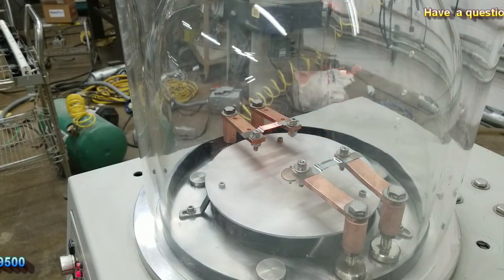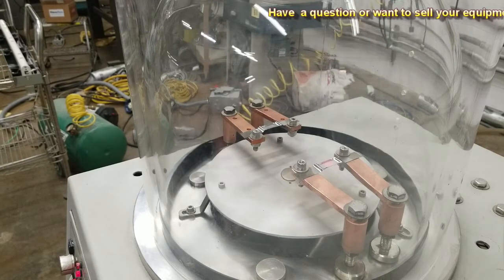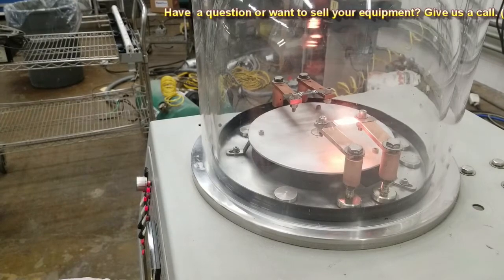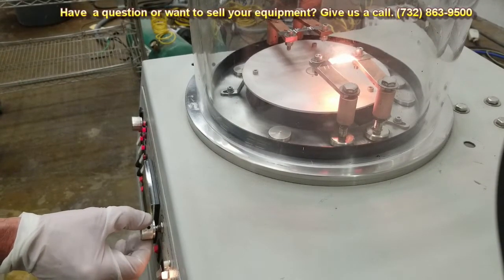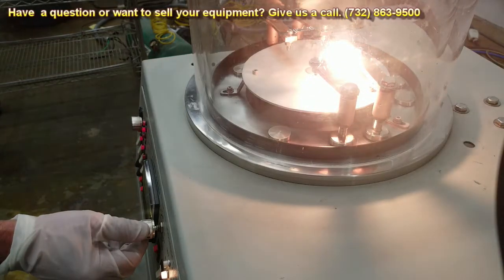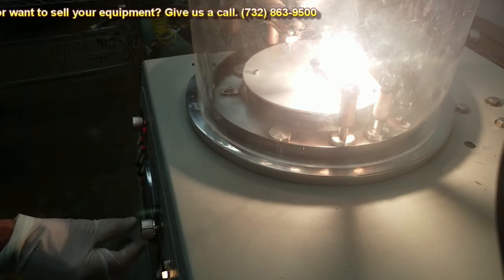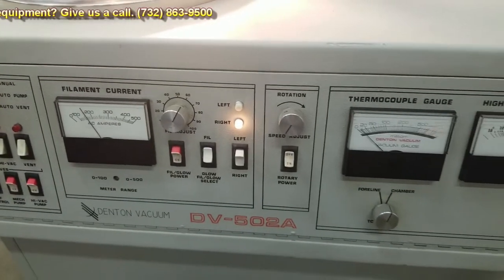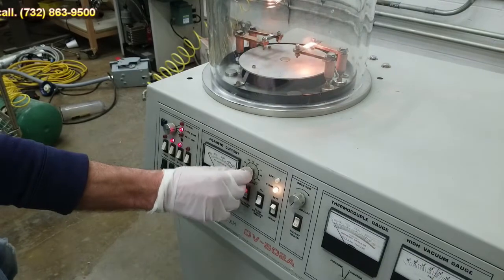I'm going to bring that down and flip it over to the right side now and do the same. That's about 100 amps right there. I'll go ahead and reset. At 60% that's about 170 amps.